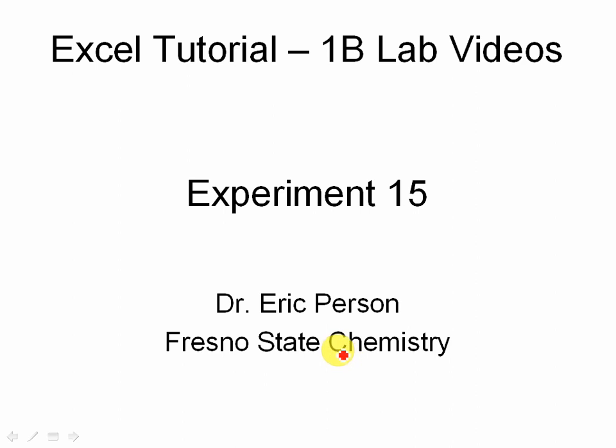In this Excel tutorial video, we'll be working on the second part of experiment 15 in Chem 1B where we're doing the data analysis using the temperature data to calculate an activation energy.